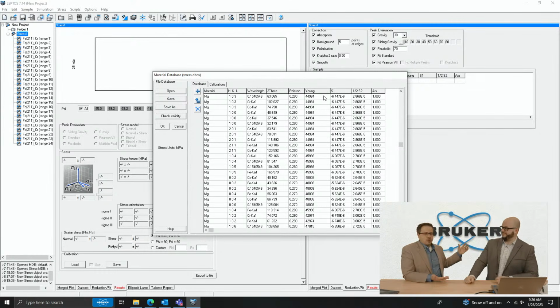So my recommendation, what I love to use, is iron powder. Loose iron powder gives you a really nice sanity check to make sure you're getting 0. Get a nice loose iron powder and put that into a sample holder. If you're going to tilt it, one thing I like to do is mix it with a little bit of grease, like Vaseline, put that into the holder, and make it nice and flat. That's a great sanity check on the zero of the machine.